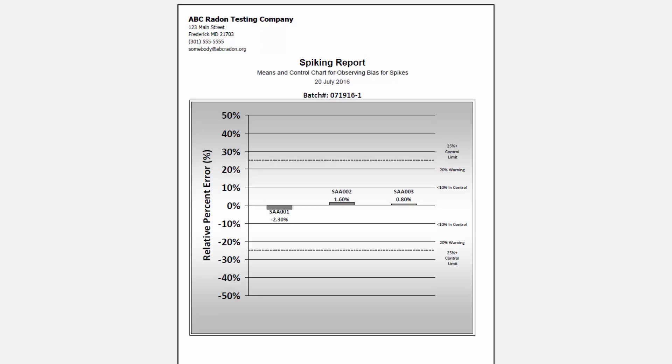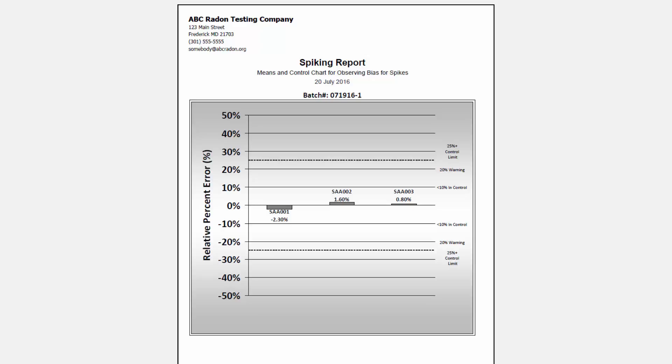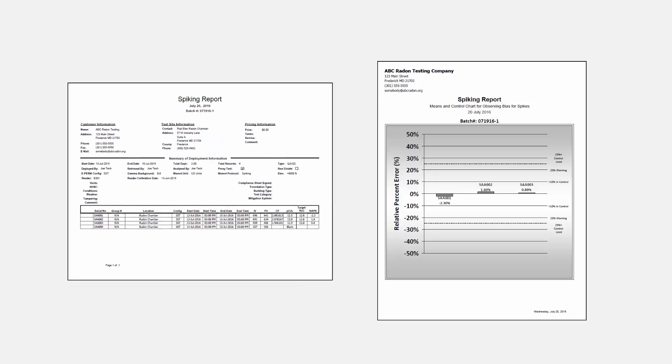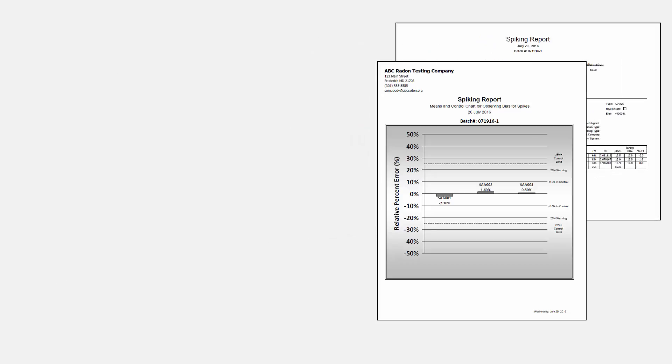The Radon Report Manager will view this spiking record as incomplete until the target radon concentration is filled — it won't register any of these detectors as completed spikes until after you enter the target and generate an RPE. The letter report from our spiking record conveys the same information as the official one from Radelec. You can also print out a lab report to go alongside it — it's always good to have a digital backup of your spiking test.